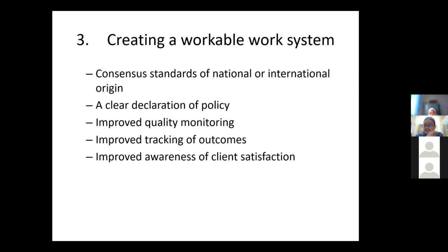So in the lab, it should be there on the wall. Quality monitoring should be there. So kita monitor, bila kita buat satu SOP, we monitor over 1 month, over 3 months. Is there anything that is challenging to implement the SOP? Is there something that we can do to improve it? Something to add or something to extract out, yeah? Improve tracking of outcomes. Okay, we do this as healthcare provider, we do all this step, good for us, but is it good? Is it convenient for our patient?